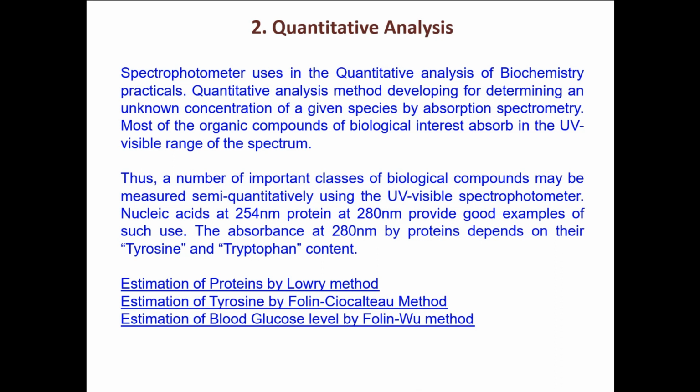Because it is the end product, you can see there is an increase in the NADH, which is directly proportional to the enzymatic reactivity, or the enzyme activity. Initially we add lactate and NAD, we make it as 0, and then we add lactate dehydrogenase.